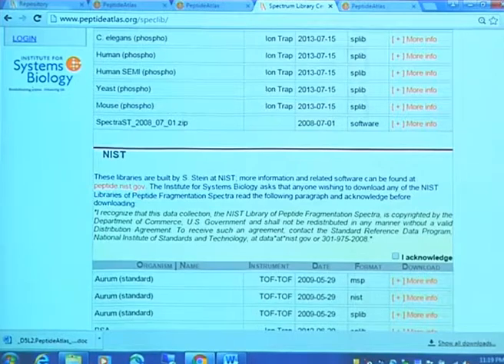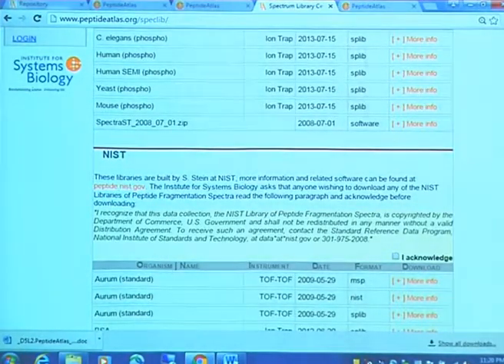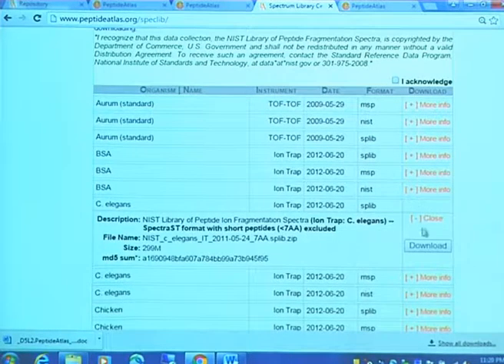Yeah, exactly. So when you go to the Petunia interface and you ask to add a spectral library, or the download spectral libraries, this is essentially the list that you're getting, and then Petunia behind the scenes asks Peptide Atlas, saying, hey, we're interested in this particular build, and basically downloads this. And so if you click on the more info, you see that there's some information, including a checksum.